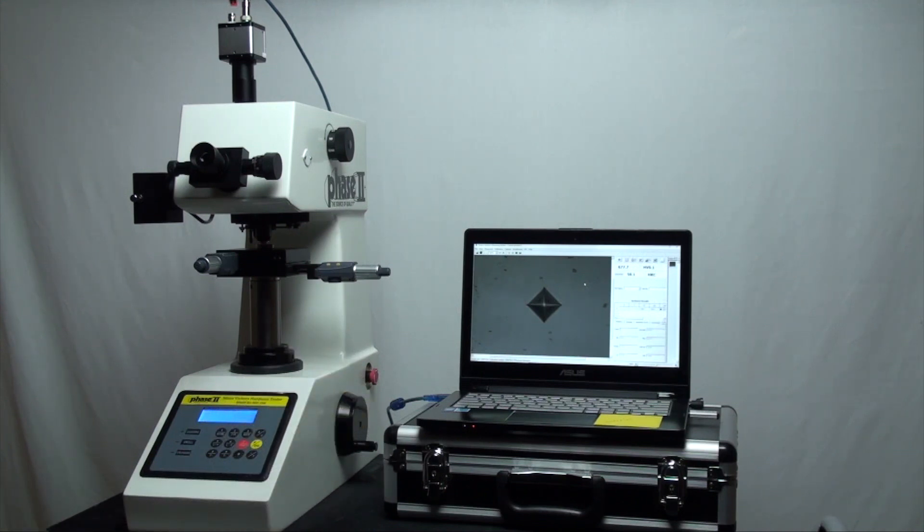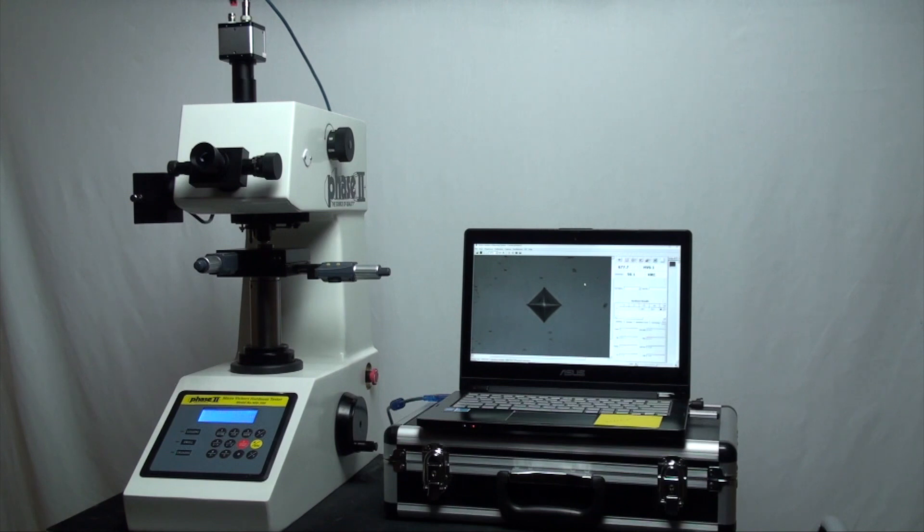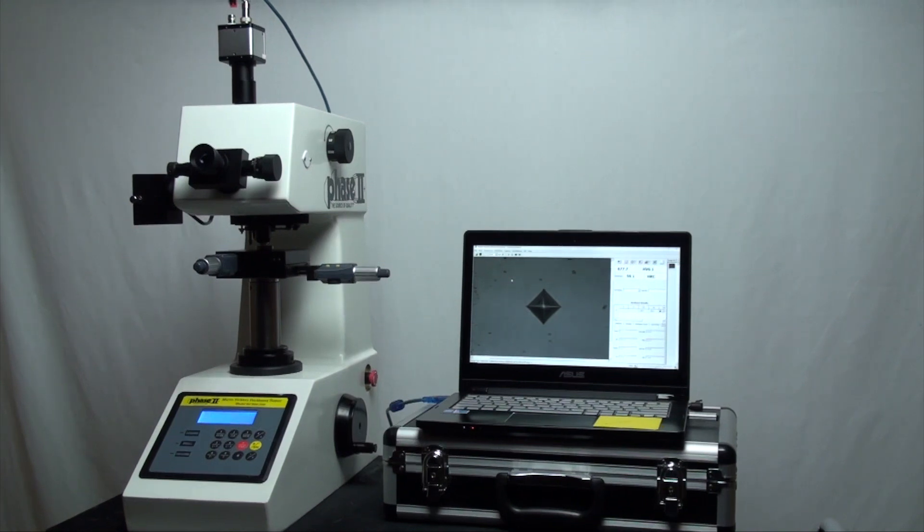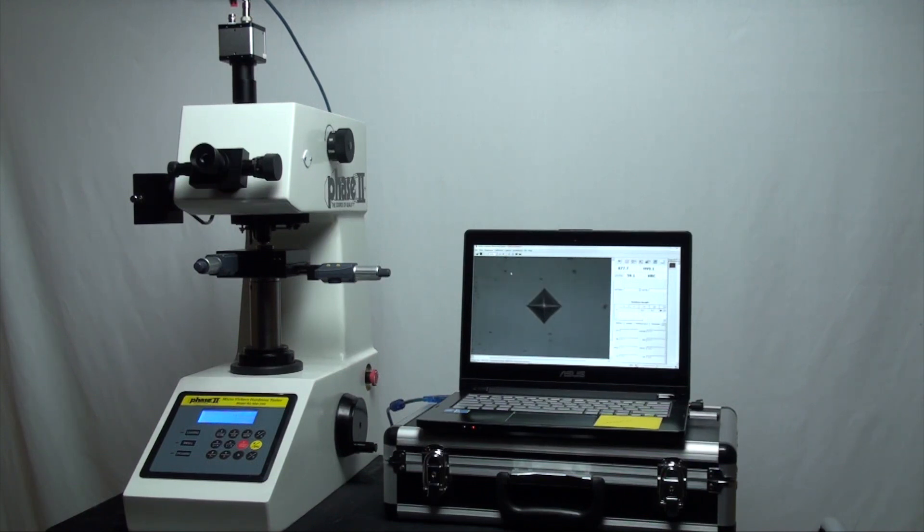Here is the control pad which is mostly bypassed by the software in complete control of the testing procedure, except for the manual turret for this series 900-390. Note that should anyone prefer to use this system without the digital optics, they are free to do so. Manual optics with drums are in place and the keypad controls all aspects of the test.